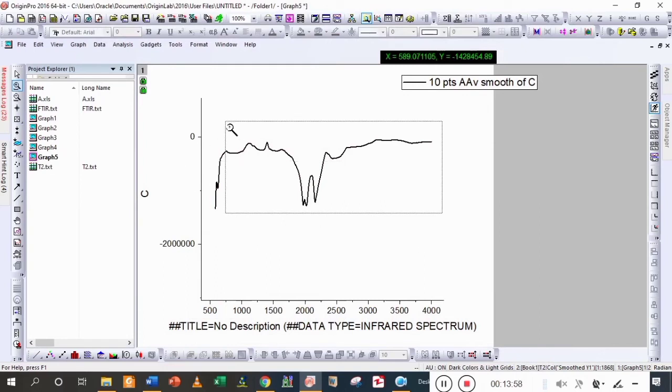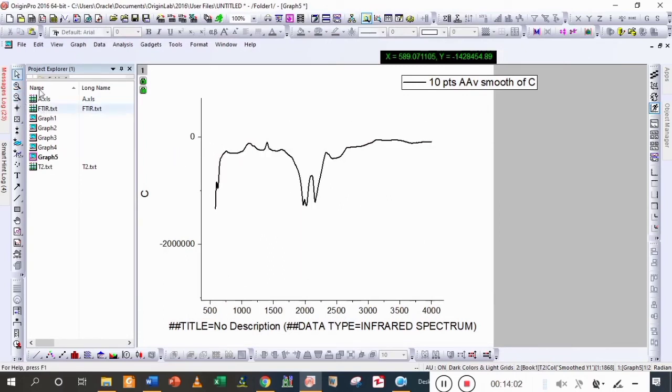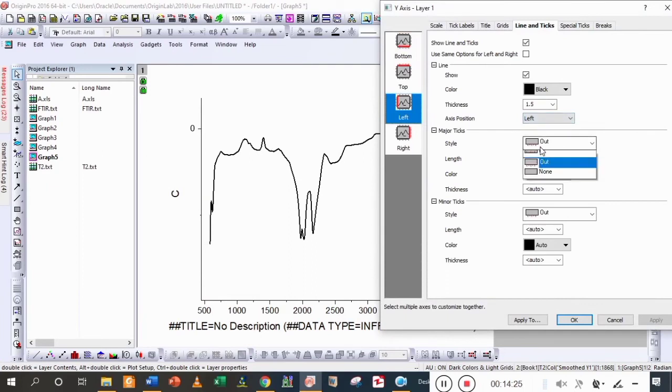So I'm going to zoom it, but you can see that the peaks value are too high, so I'm going to change it in some small zoom ratio. Yeah, there's a little bit change in peaks. So firstly I'm going to rescale it, none and none.